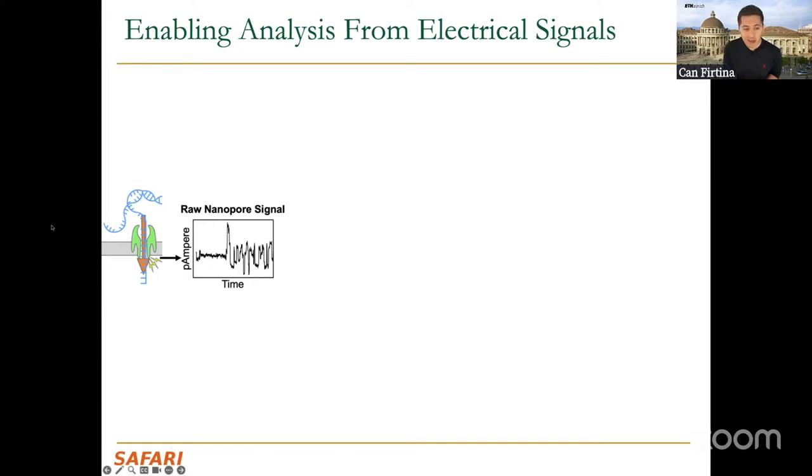And this is because we have this narrow region here, which is known as the sensing head. In this region, whatever base is closest to the region causes the disruption most. But still, whatever is surrounding this narrow region is also causing an ionic current disruption.